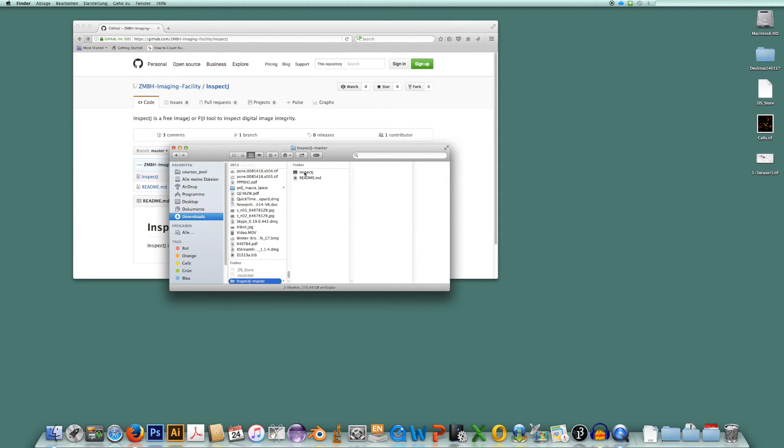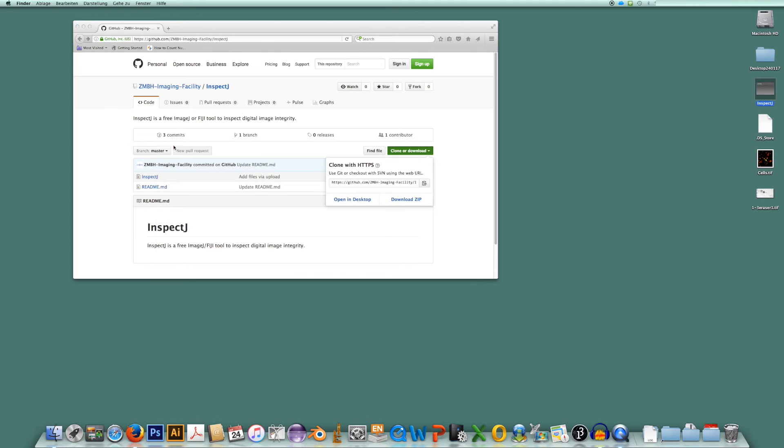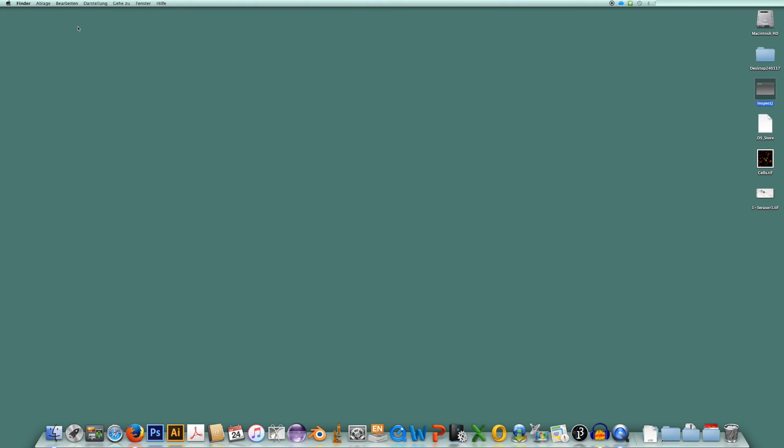And here is my software. I would just drag and drop InSpecJ now onto my desktop, but of course you can put it wherever you want. Here it is. Let me just close these two windows.